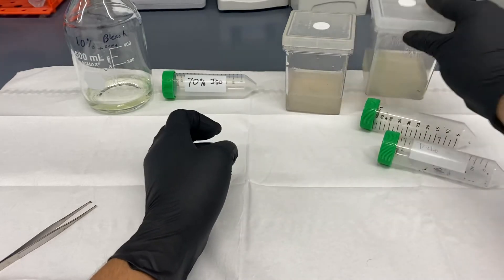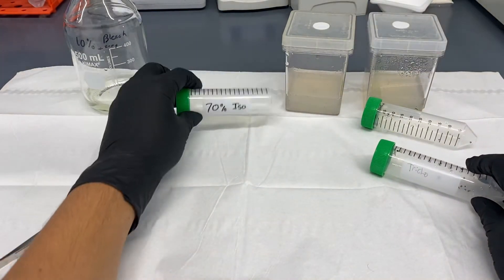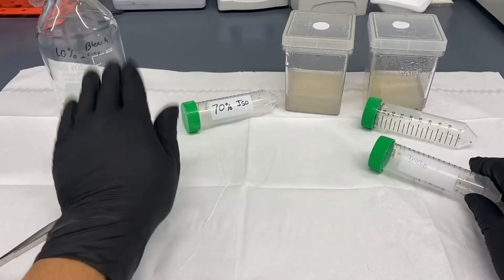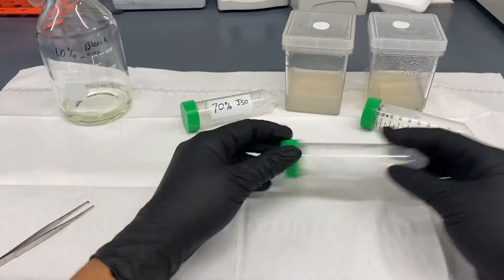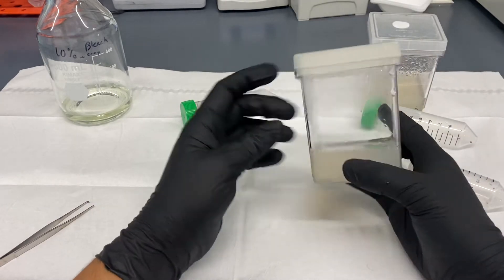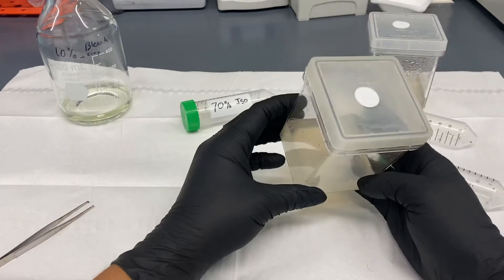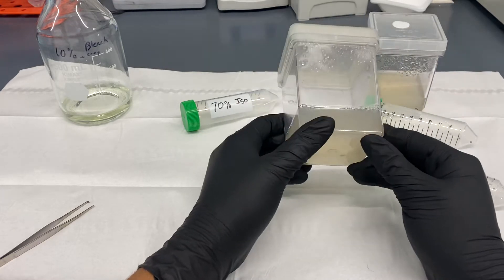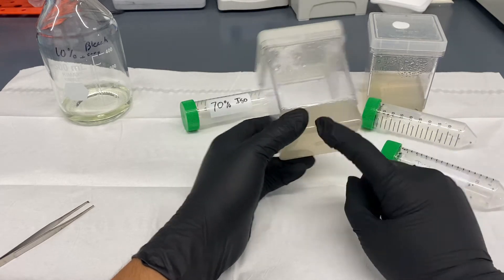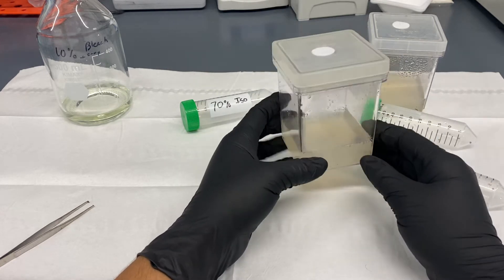You can see I have 70% isopropyl alcohol and a 10% bleach with soap. These are the two solutions I use to disinfect because tissue culture is a sterile practice, 100% sterile, meaning this media right here supports bacteria, fungus, anything you can think of that can grow, algae will grow on this media.